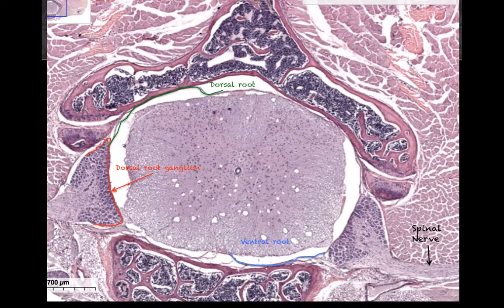Okay, and now zoomed out a little more, this is the vertebrae, right here. And this is the spinal cord passing through the vertebral canal, sorry. So this is the central canal, and the dorsal root is right here, which contains sensory information. So this is the axon of a sensory nerve passing from the dorsal root ganglion. And then everything from there is the dendrites of the dorsal root. Actually, it turns into the dorsal ramus, and it is sensory information.